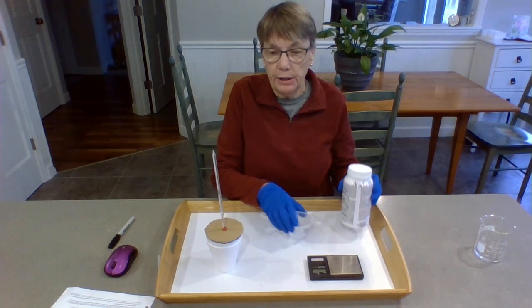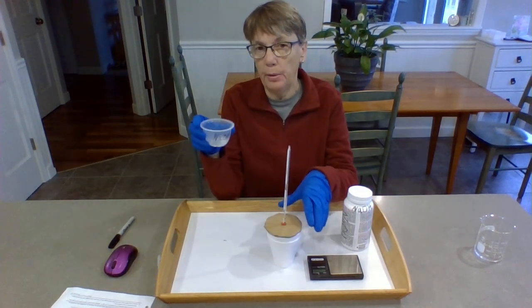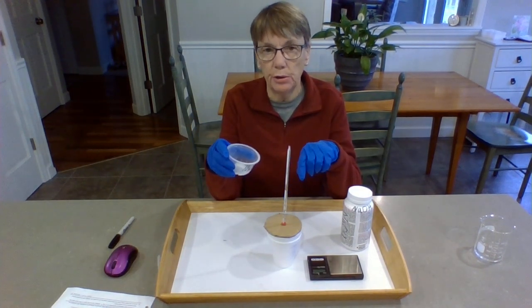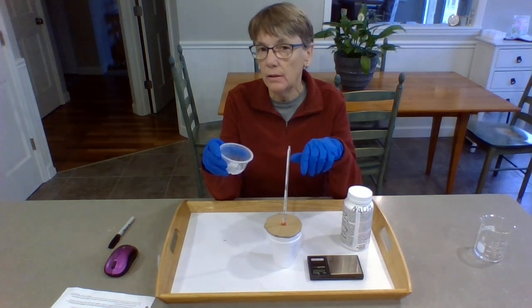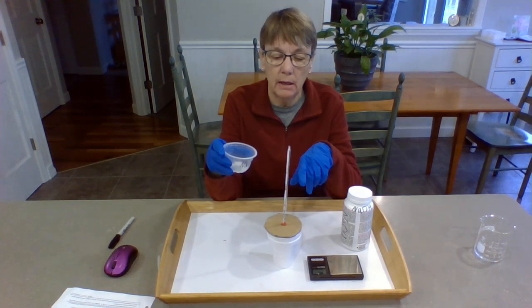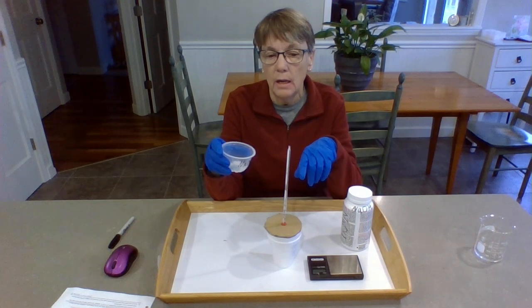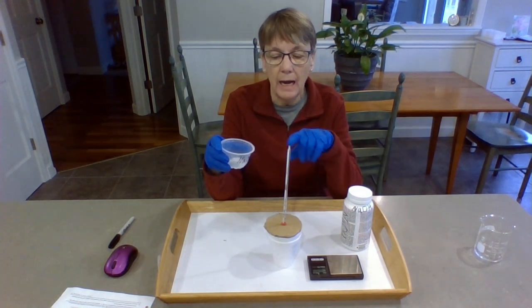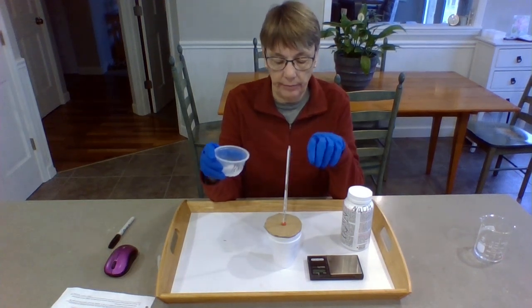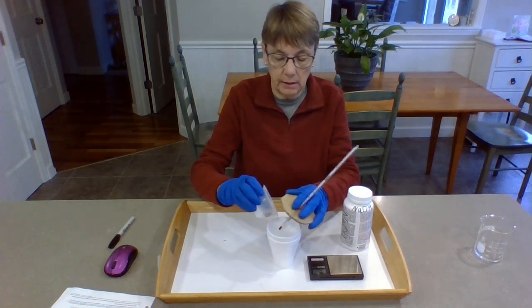Okay, now I'm going to cause the reaction to occur. I'm going to take the lid off the calorimeter and I'm going to put the sodium hydroxide in the vinegar. You should immediately start seeing the temperature rise. This is an exothermic reaction. What I want to do is keep watching the thermometer until it reaches the highest temperature before it starts going down. That will be the point where I need to record the temperature. I'm going to add this to this.